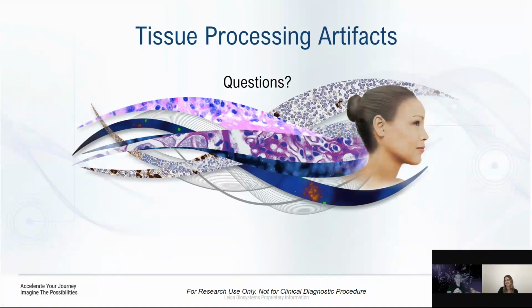Leftover blood. There's been discussion historically in the laboratory about bloody specimens being stored in formalin. It can alter the pH, but it's not significant enough from the discussions I've had. When it comes to moving it through the processor, it does dirty up everything else as it goes down. So I think it's very subjective whether it can actually impact any kind of morphology or IHC. I am not aware of that.